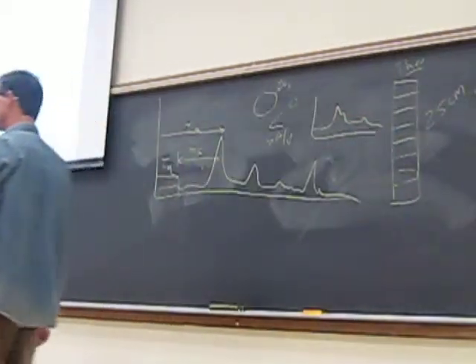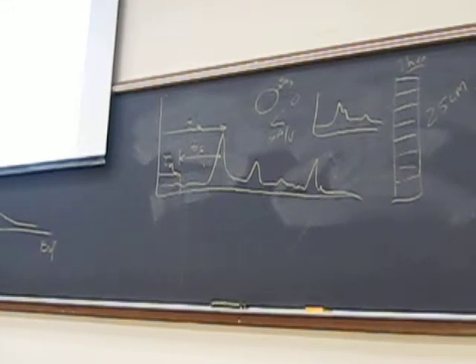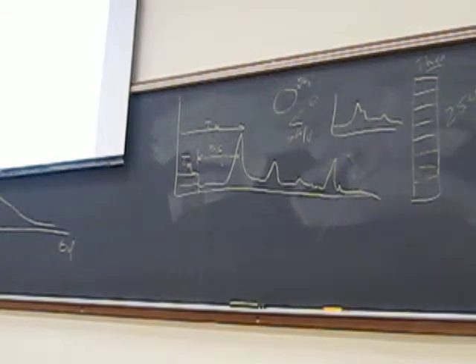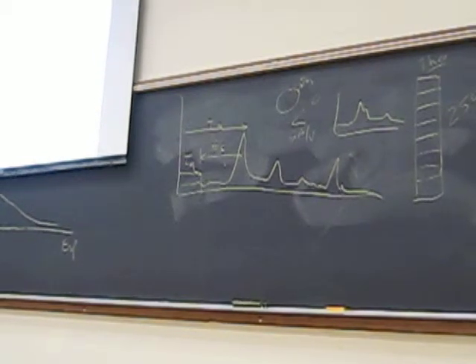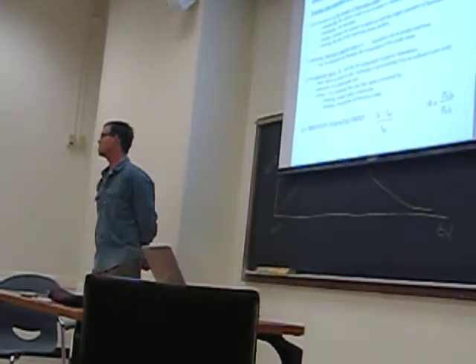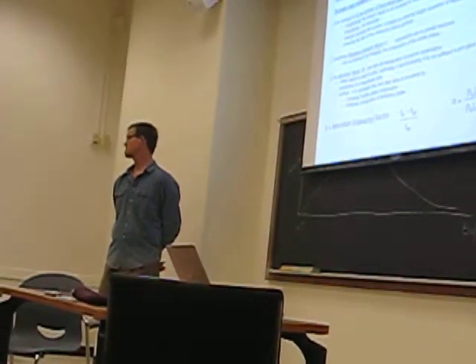So you're saying a smaller bead size is going to give more resolution. Is there going to be any time when you want a larger bead size? Or why wouldn't you just always want the smallest size possible? Besides the price, well, there's a price component, and smaller bead sizes are limited by flow rate. You can't pump mobile phase through as quickly because the pressure builds too high because of the resistance to flow.